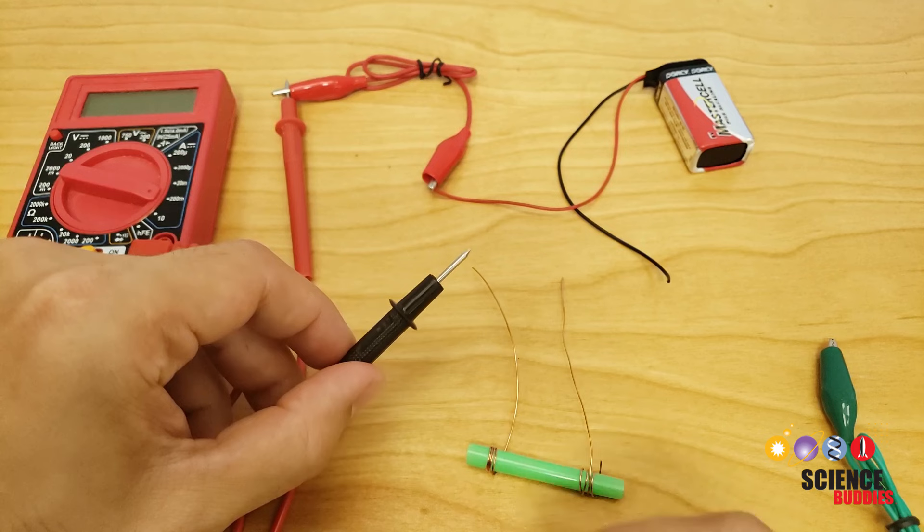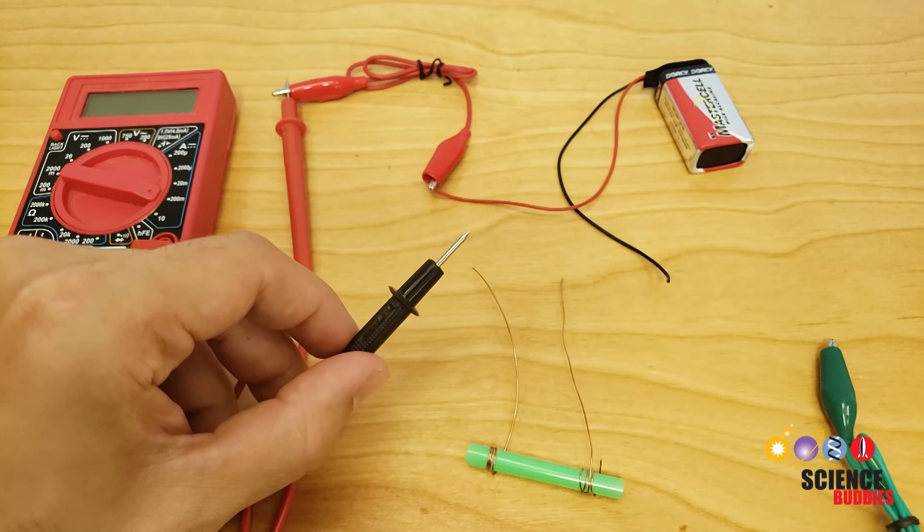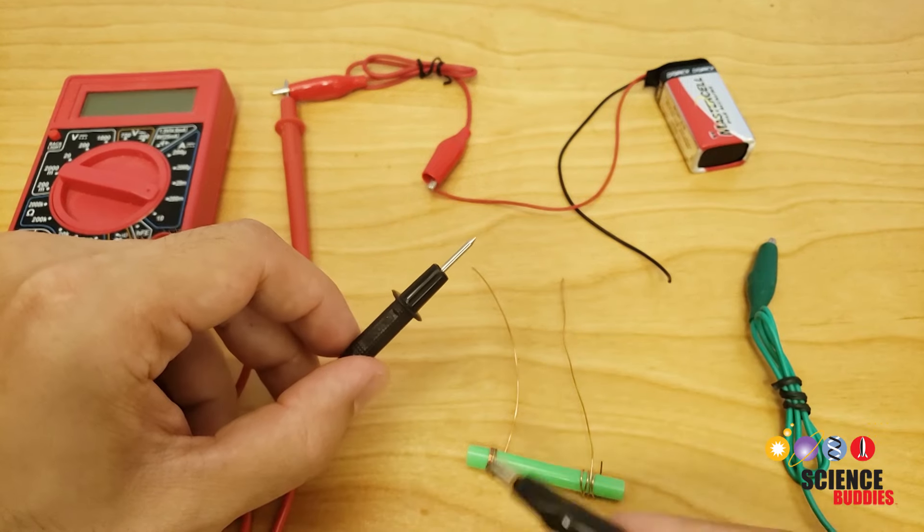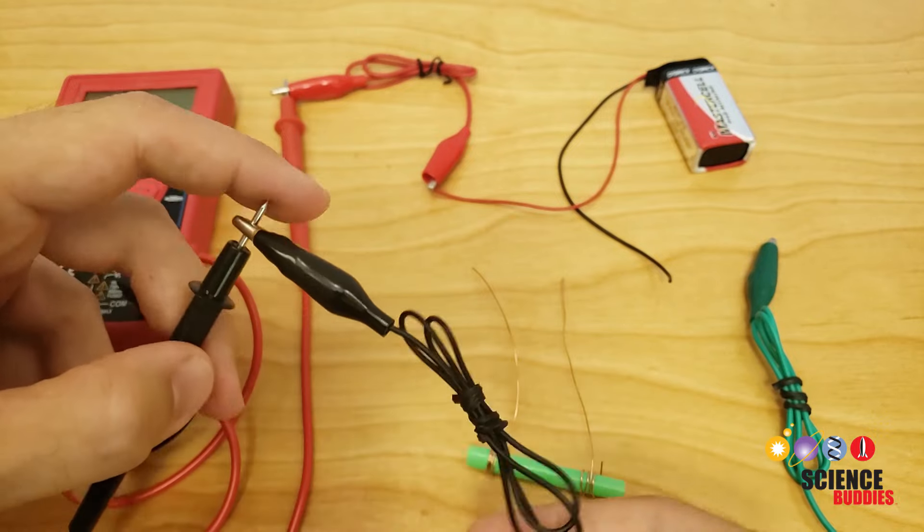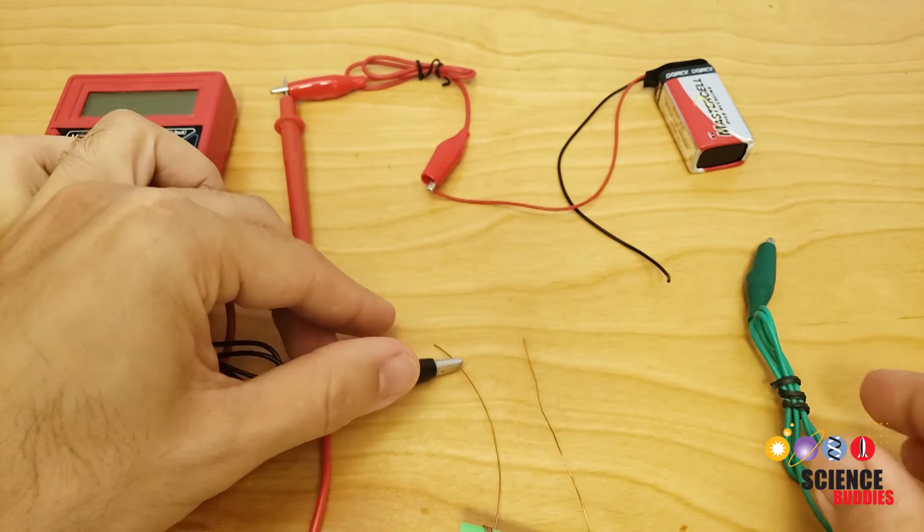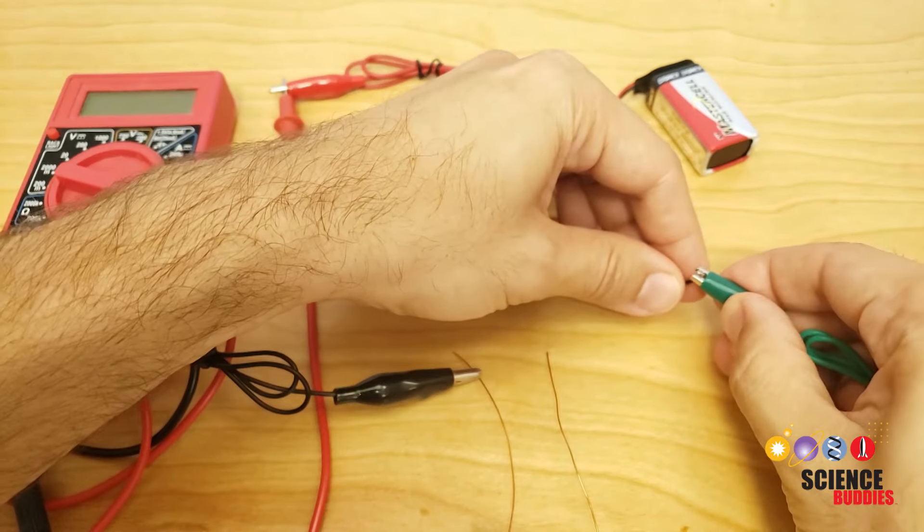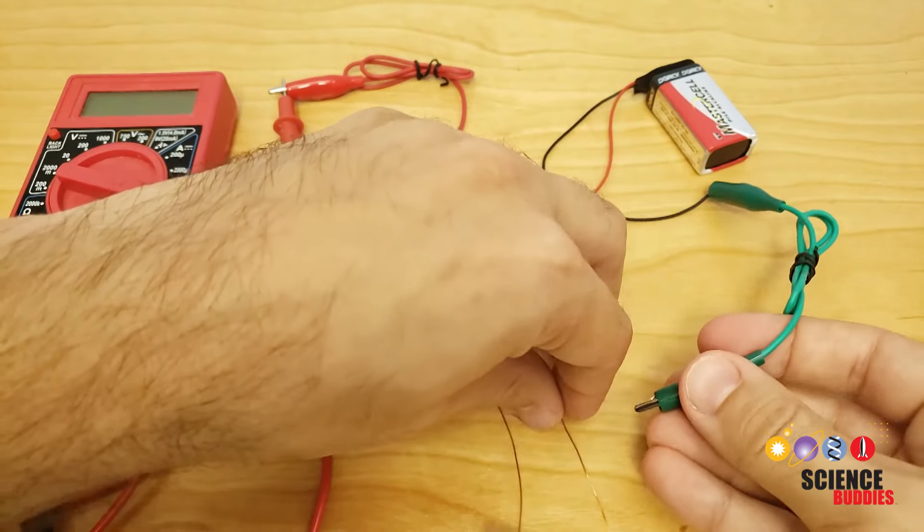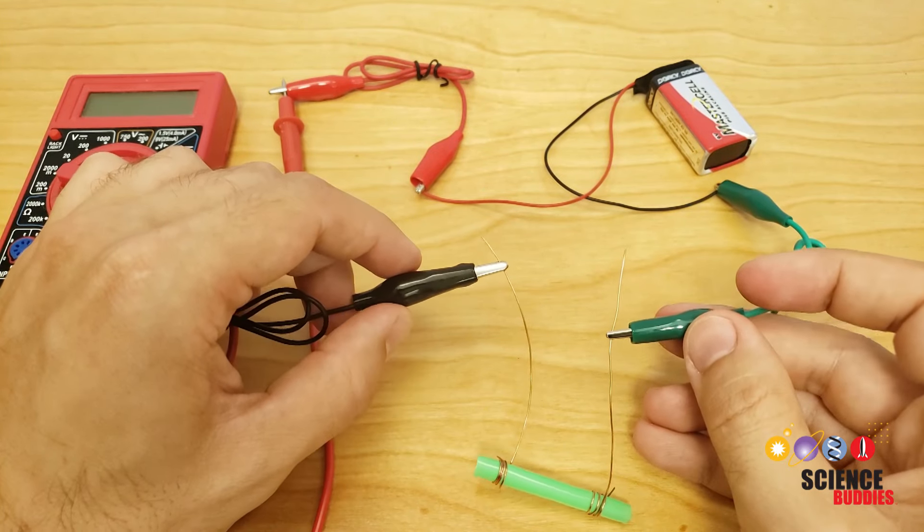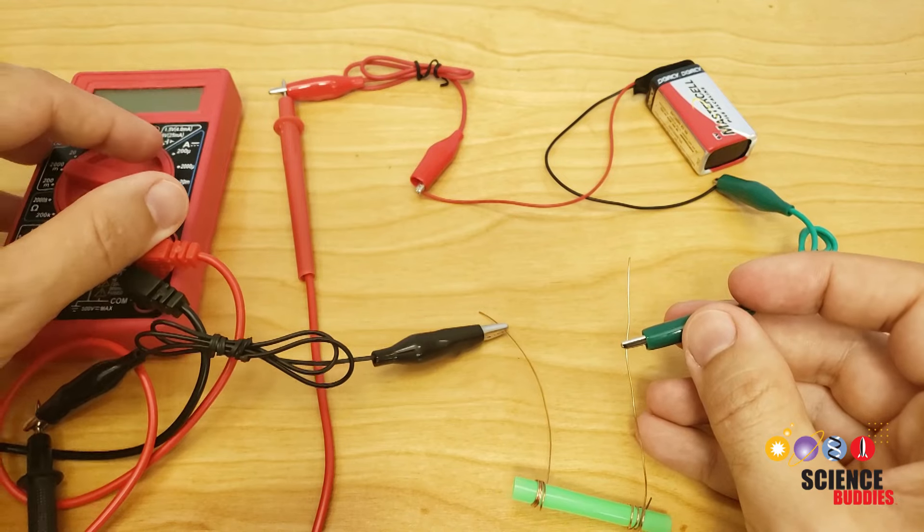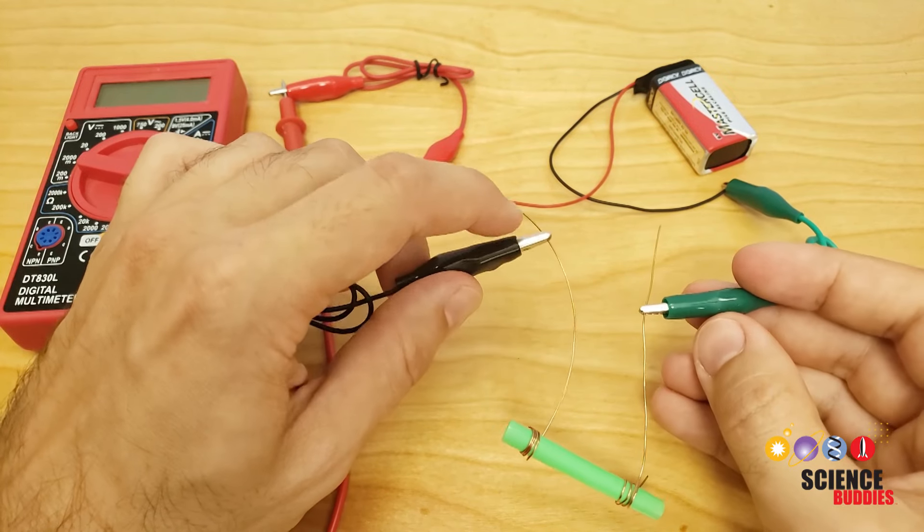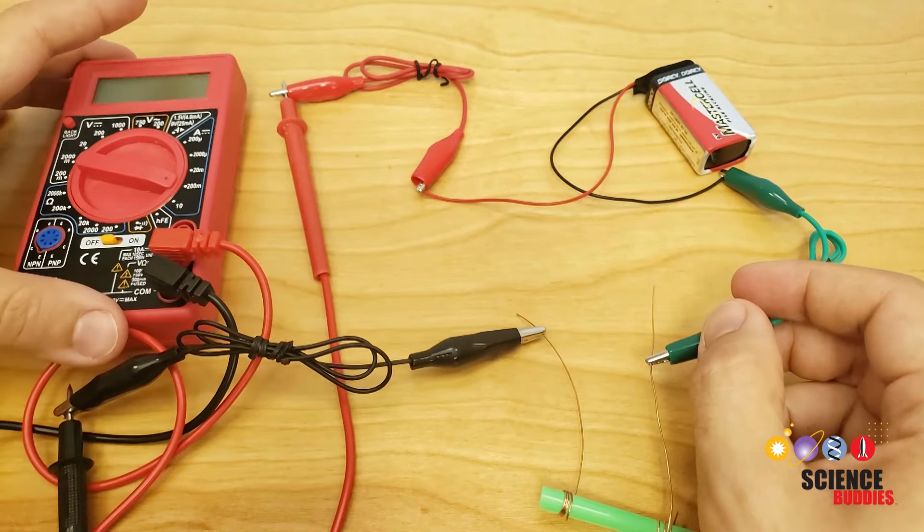You should have two remaining loose ends in your circuit, the black multimeter probe and the black wire from the battery. You are going to use your two remaining alligator clips to connect those wires to your conductivity sensor. So I'm going to connect one of them to the multimeter probe and then to one wire of the sensor and the other one to the battery wire and to the other wire of the sensor. Now, this is where it becomes very important not to let any of the loose pieces of metal in the circuit touch each other because this can create a short circuit and blow the fuse in your multimeter.